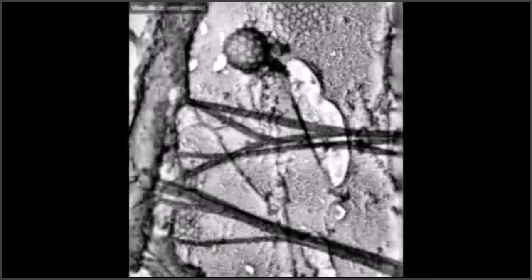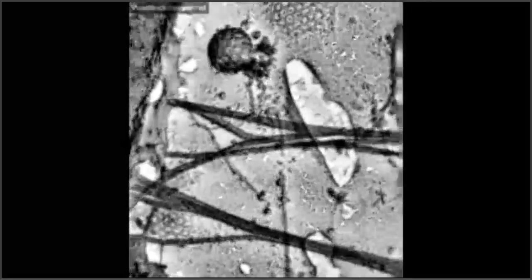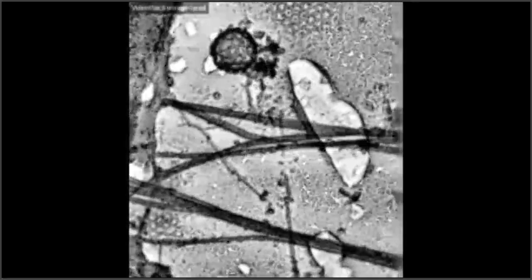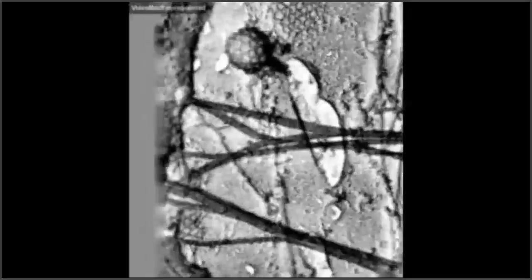This is the leading edge of an epithelial cell that's undergoing endocytosis. What you can see here at the very top is a clathrin-coated budding vesicle. That's the round thing in the top left-hand. Yeah, that has a sort of cage pattern to it. And you can see another one just up to the right of it forming at another patch just off to the side.